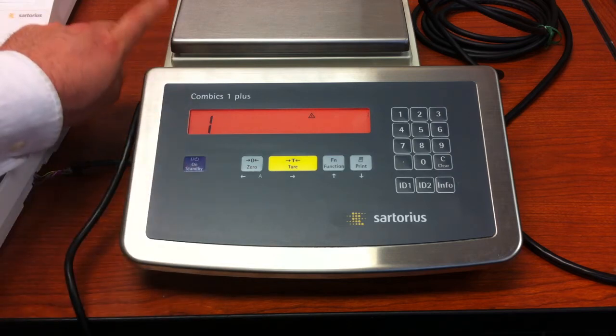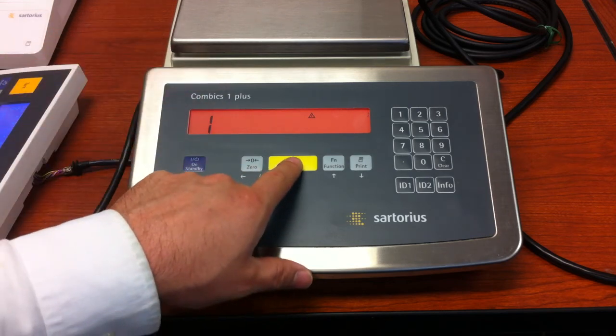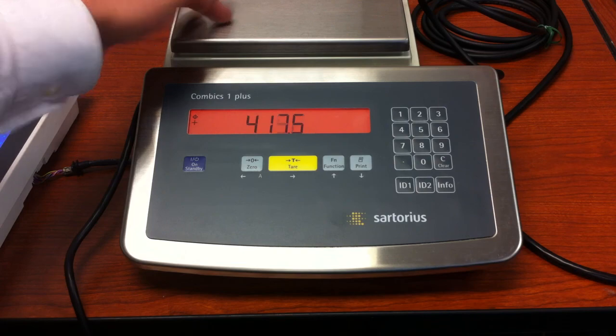We are now showing a 1, which means we're inside the menu of the IS platform. At this point, press and hold the tare key until the unit resets, and as you can see, your weighing point has been restored.